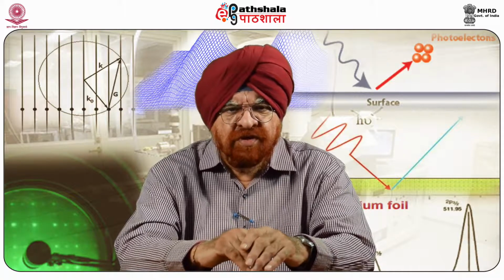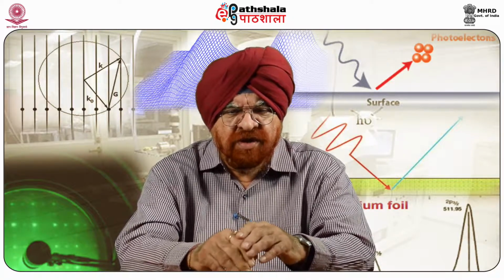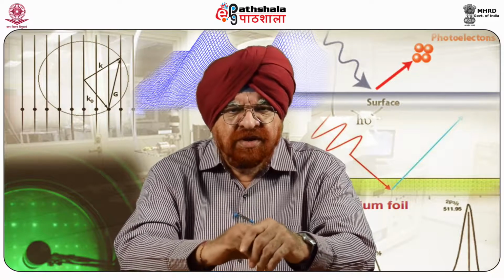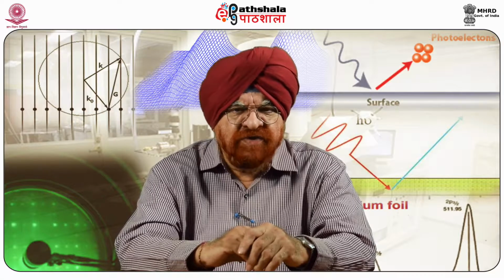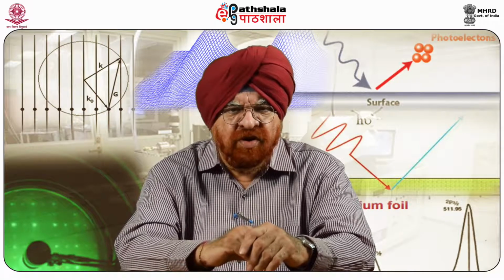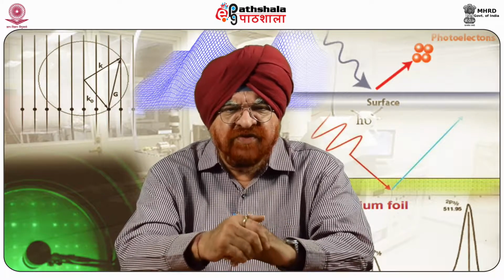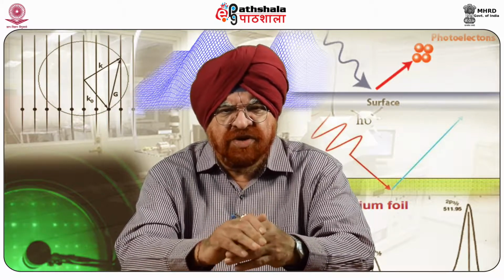www.intechopen.com. Magnetic force microscopy will involve basic principles and applications, and is important because of the long range nature of magnetic forces. You will find there are techniques where it can be used.